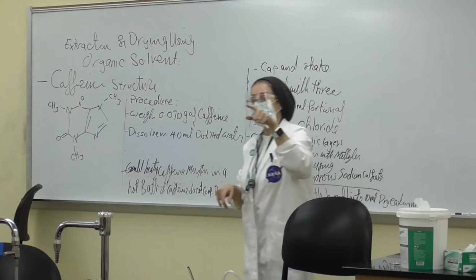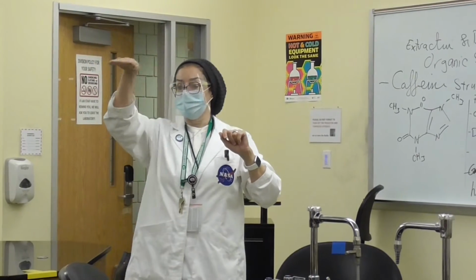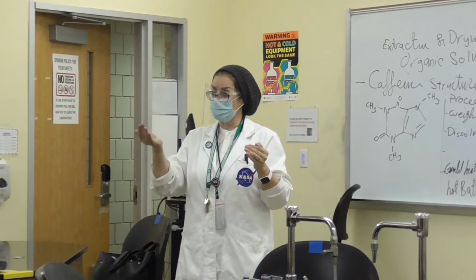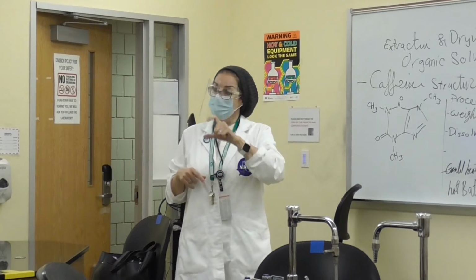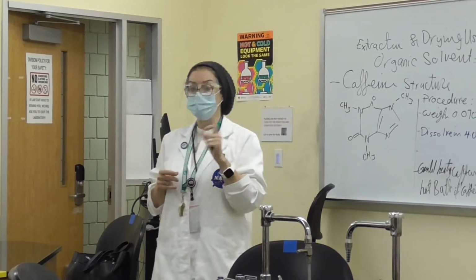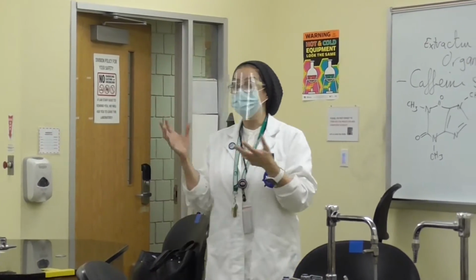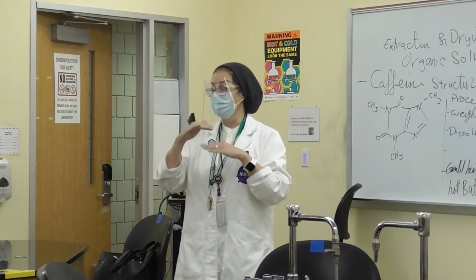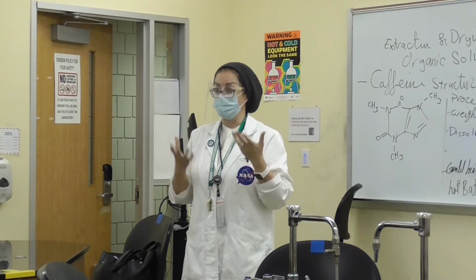We have centrifuge tubes, which are over there on the back bench. You're going to have the mixture of 4 milliliters of water with dissolved caffeine, and you're going to add 2 milliliters to the first. This is the first wash. It's like you are rinsing it, so give it a good rinse. We also have the vortex over there to mix it. After you mix it together, let it stand a while, and that will give the separation between the aqueous layer and the organic layer.